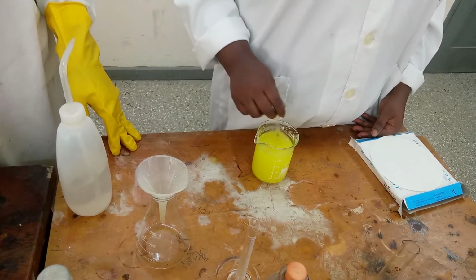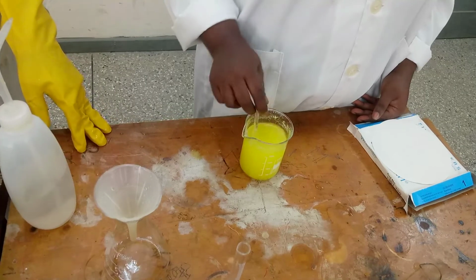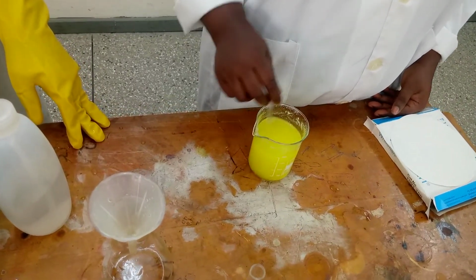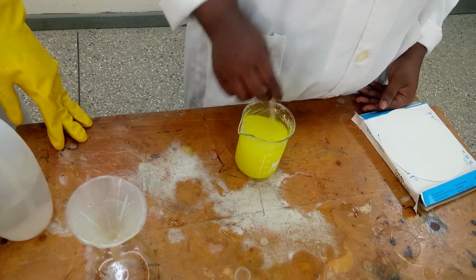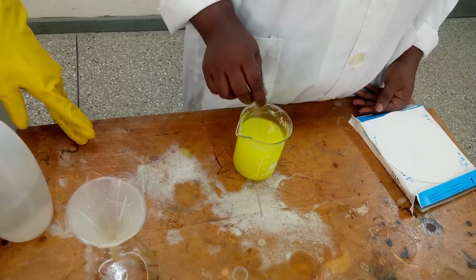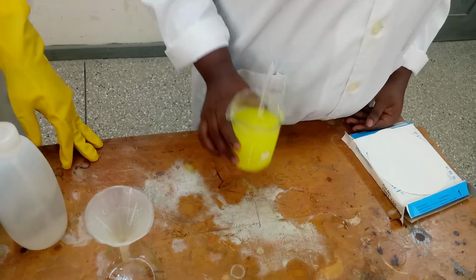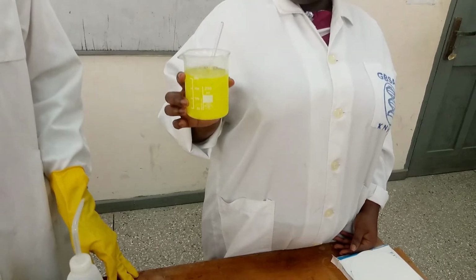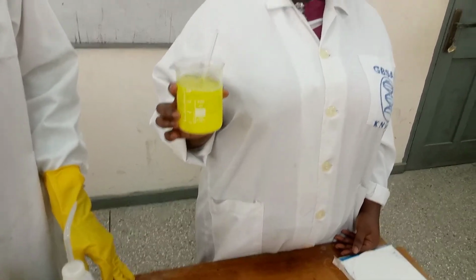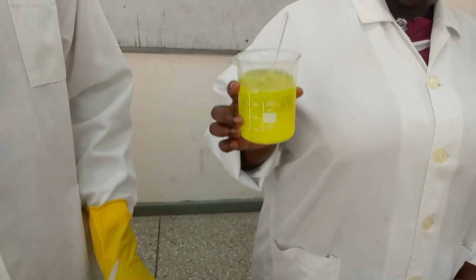Alright, so that is that. You can see crystals are forming under, but one thing you have to know is that you allow your content, the mixture, to cool to room temperature before you pour it into the water. Alright, you can see the beautiful crystals under. Oh, what a beautiful crystal. You are going to filter it to get the crystals.